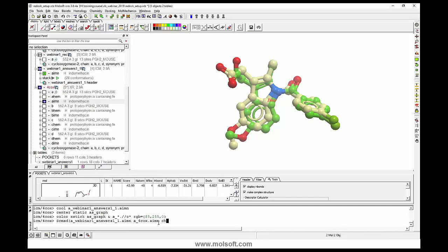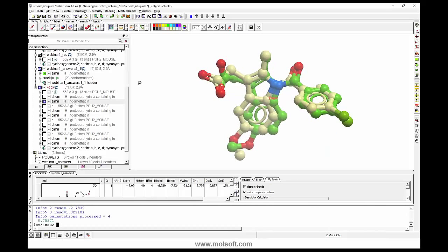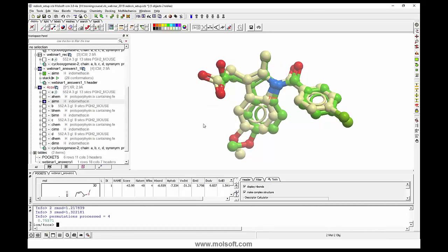It's going to compare based on chemicals, so on rings and things like that. Okay, so the RMSD is 0.7 or 0.8 if you round it up, angstroms. If we increase the thoroughness, we might improve that, or if we increase this docking effort parameter, we might improve that even better. There may be other factors which cause these small changes in the pocket, but it's pretty decent docking.